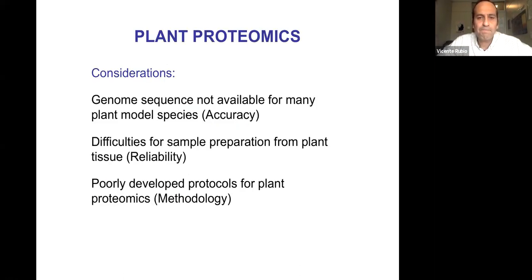And a few considerations when we work with plants. One of them is that the genome sequence is required to identify all the proteins analyzed using the different techniques I will show afterwards.